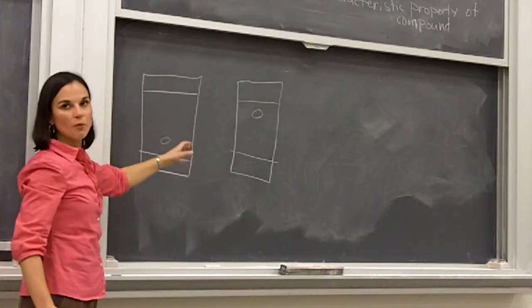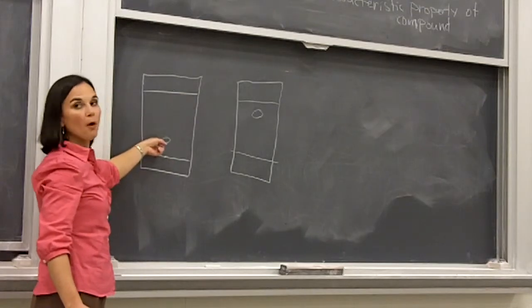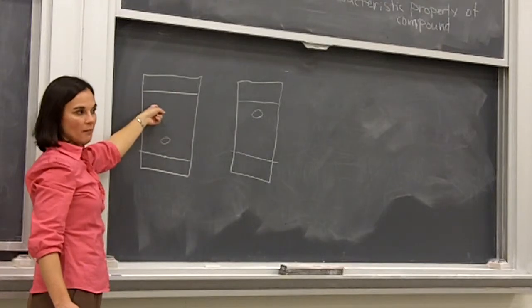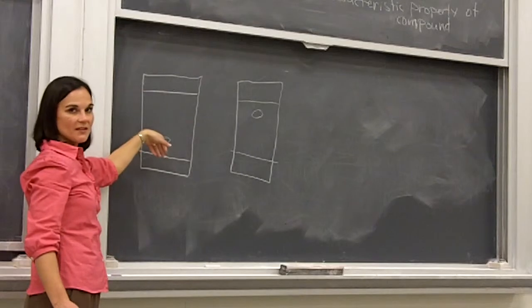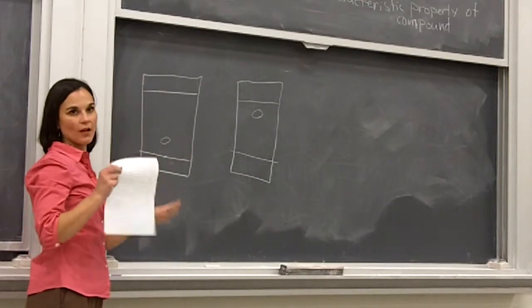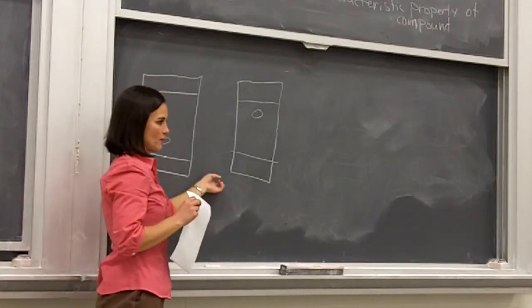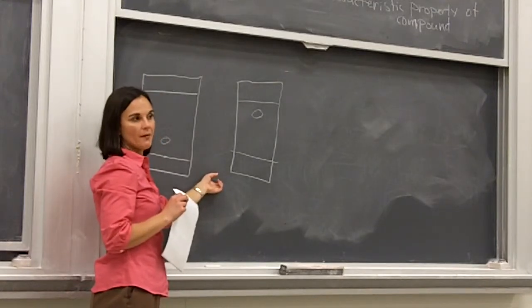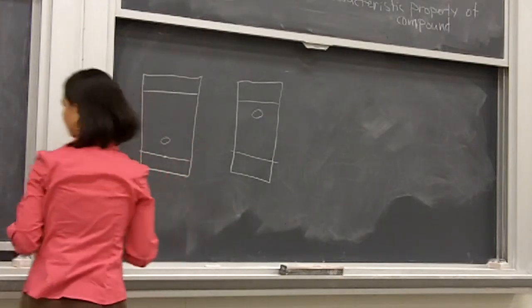So there's that relationship with the solvent, as well as smaller Rf values for more polar compounds and larger Rf values for less polar compounds. So there's a relationship between what you are analyzing with TLC and the eluent that you're using. You have to keep those two ideas straight and what you need to do to take care of specific situations with those. Okay, is everybody set with that? What happens with the eluent and what happens with the actual compounds on the TLC plate? Okay.